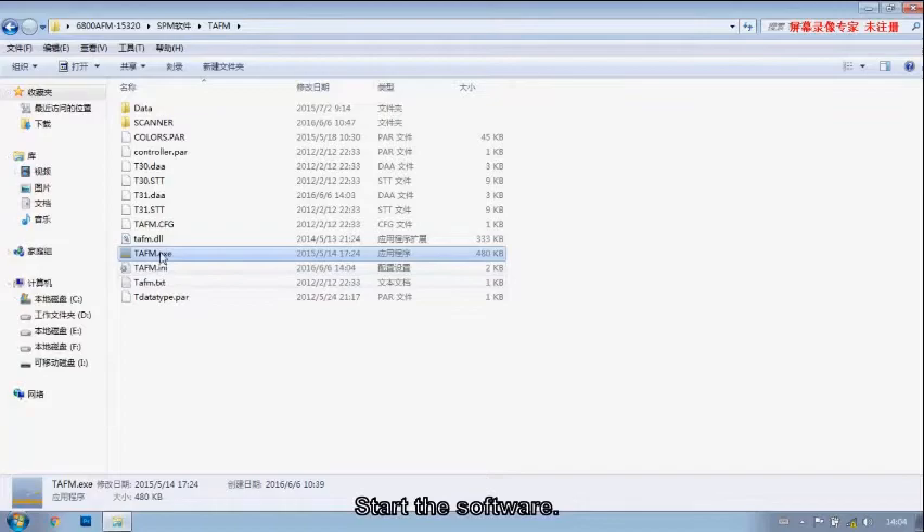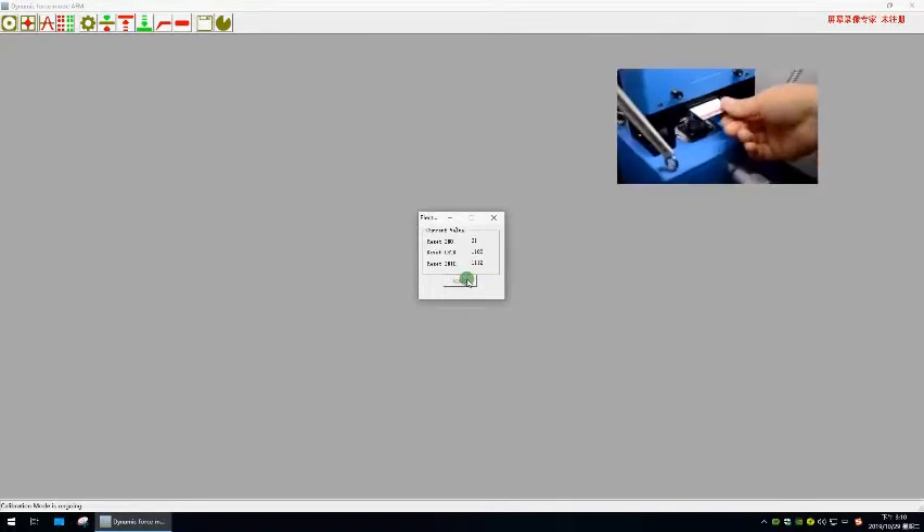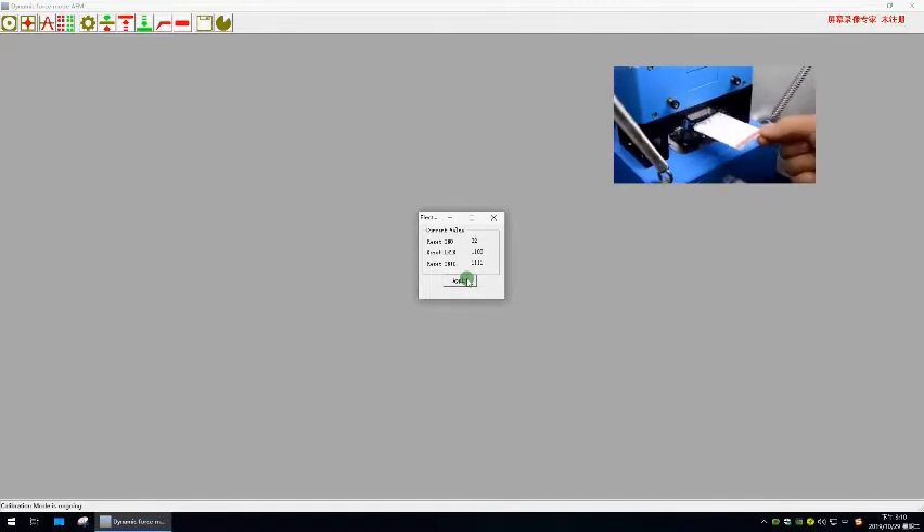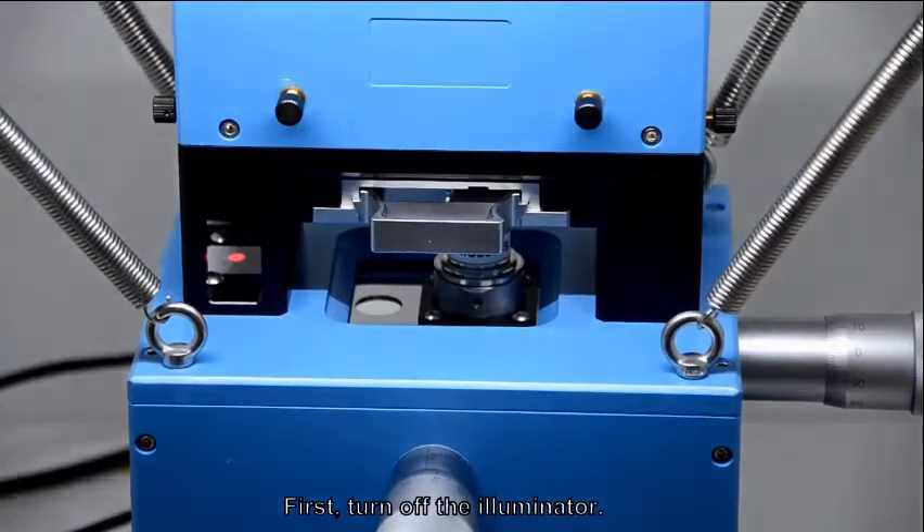Put the sample on the sample stage. Start the software and choose solution. Insert the calibration card above the prop stage, then do the electric calibration.